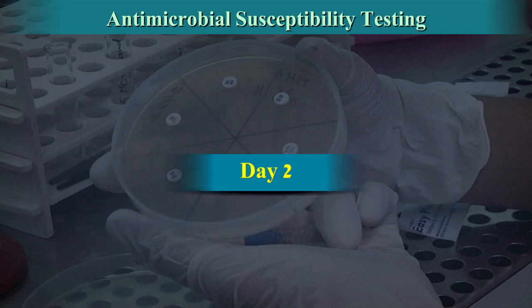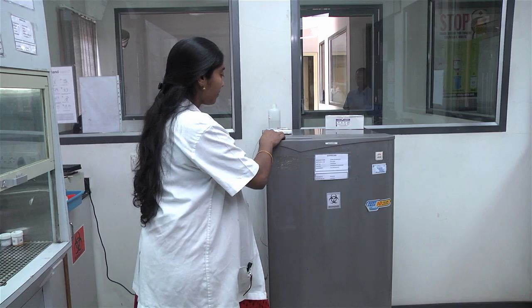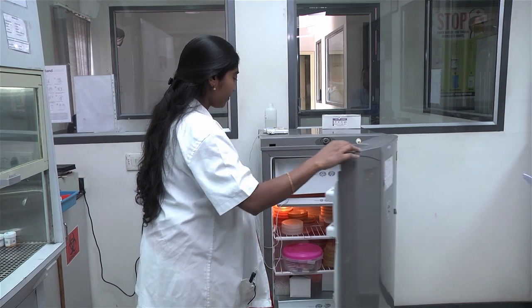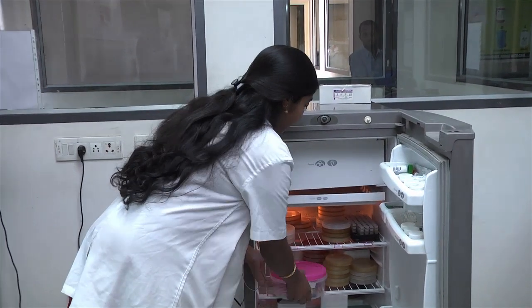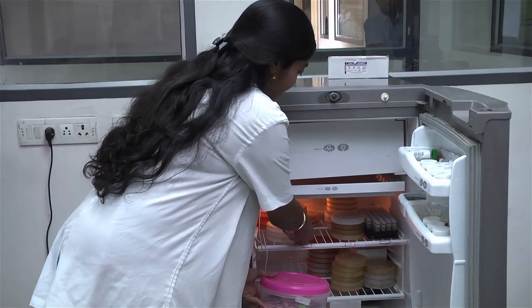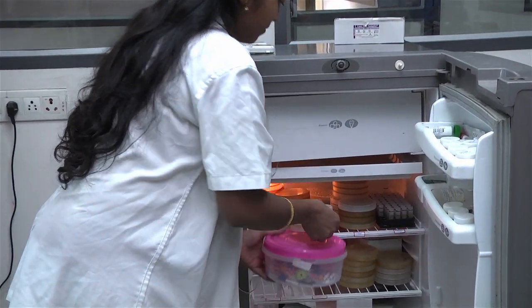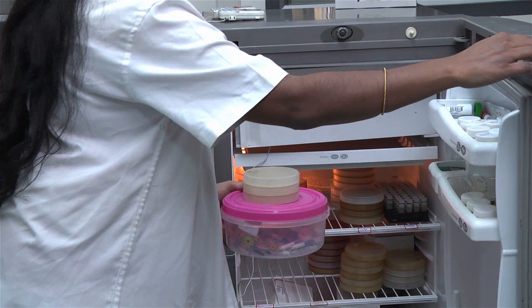Day 2: Remove the antimicrobial discs and the Mueller-Hinton plates from the refrigerator and keep them outside for 20 to 30 minutes until they reach room temperature.